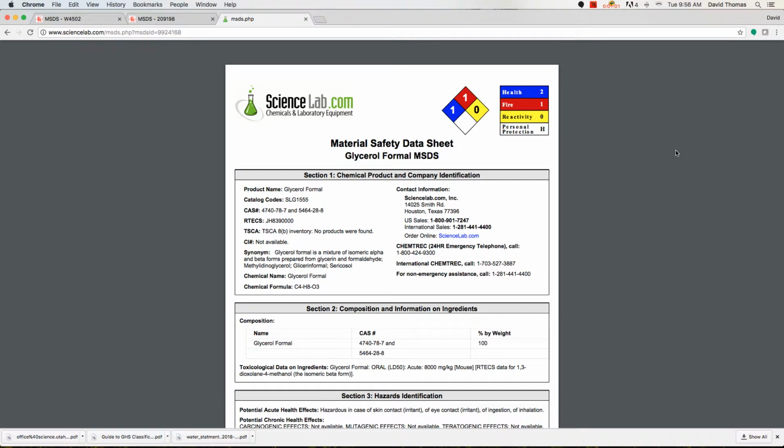Second, the use of the information found in the SDS forms should always be combined with common sense and good lab hygiene practices. And lastly, this video is only meant to serve as a brief introduction to what a safety data sheet is, where you can find them, and the kind of information they contain. While this is extremely important initial information in and of itself, you need much more training and explanation for you to fully understand and interpret all of the information found in the safety data sheets.